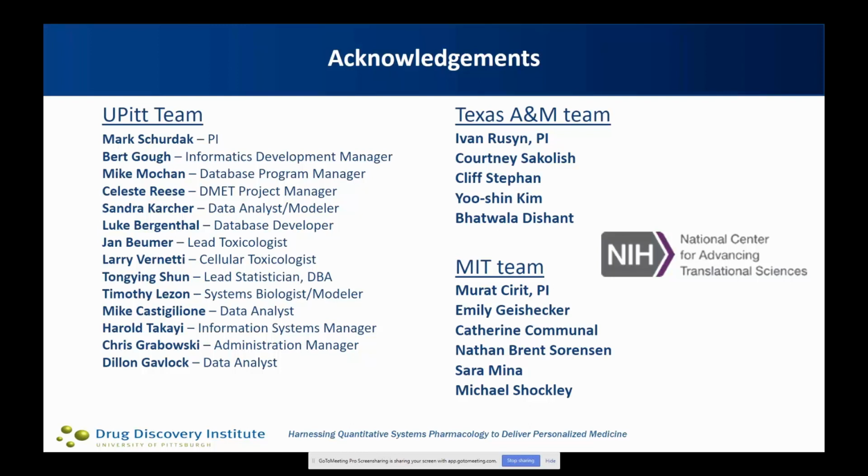That's actually something that we're just working on now. We certainly had that intent from the start, but priorities are priorities. We now have a complete study with a complete set of images generated along with that study, and we're working on integrating that so that people will be able to look at particular data points and bring up images as a reference for interpreting those data points, and also, if they wanted to do some additional analysis on the images, to be able to access them.